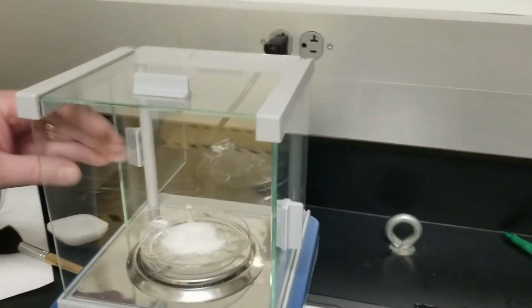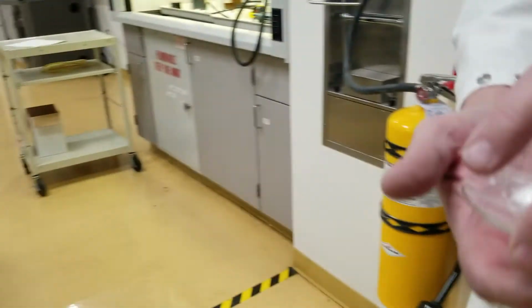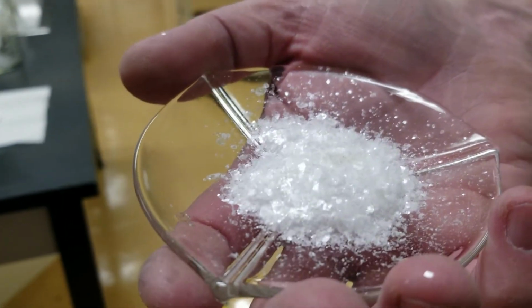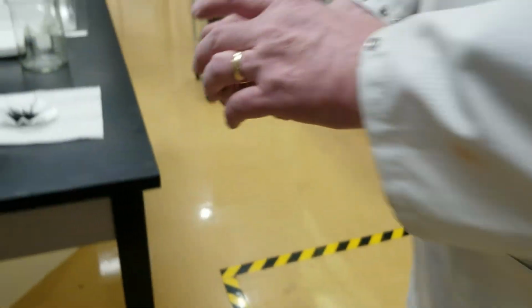Now for our melting point. Get one last nice close-up of the product while we're in the light. Yeah, nice. Looks like glitter. It's a very pretty product.